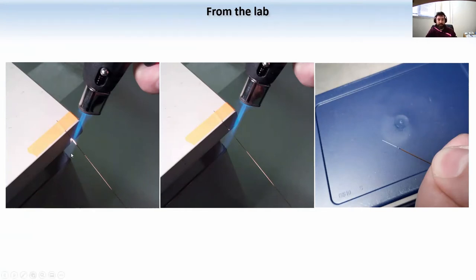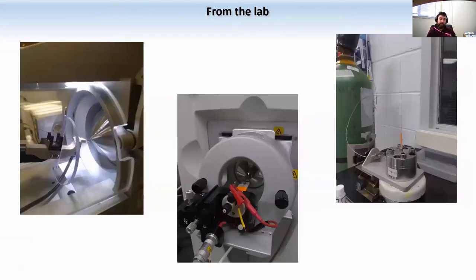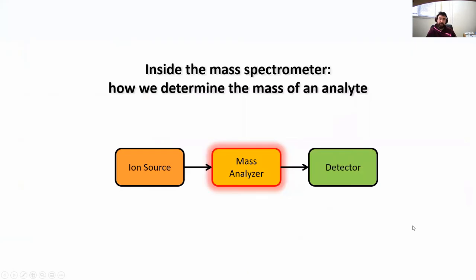These capillaries have a very small internal diameter, 50, 100 micrometers. We create a tip. This becomes our electrospray. And then these capillaries are packed with material that we use to separate our molecules, and we can run them in the nanoflow range, at very, very low flow rate. This is just them connected in front of the mass spectrometer, and this is how we pack them.